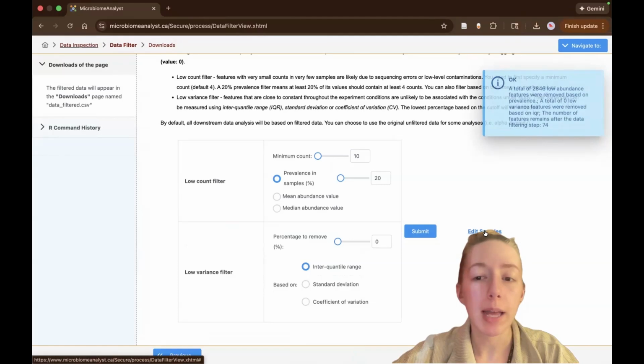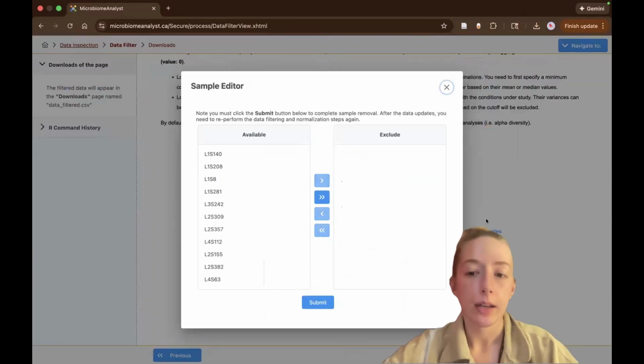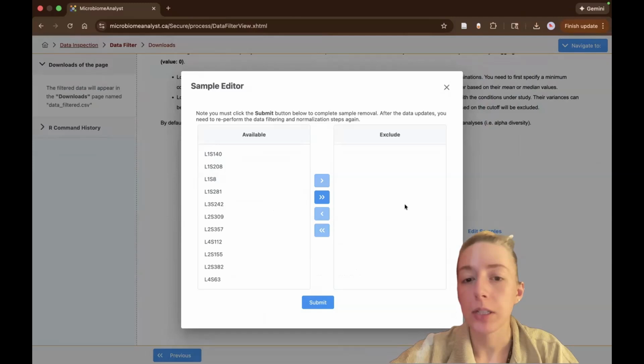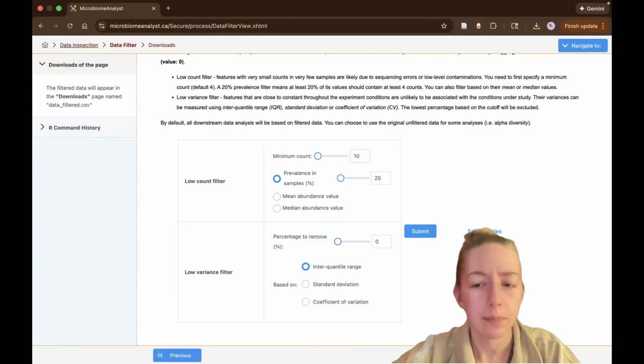If we want to edit any of the samples, including discarding any samples that, let's say, had a very low number of reads, we can do that here, just like this. But we didn't see any that had anything too low.